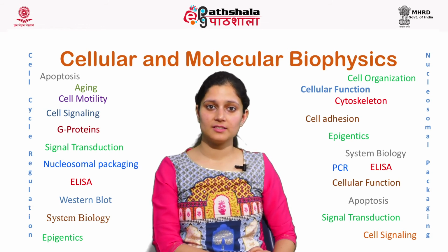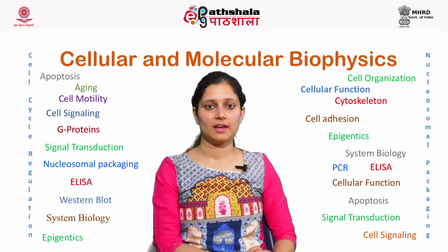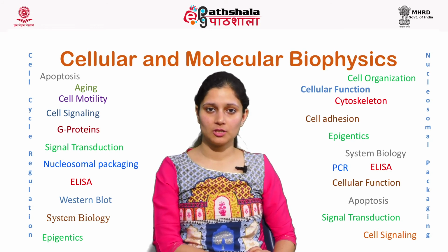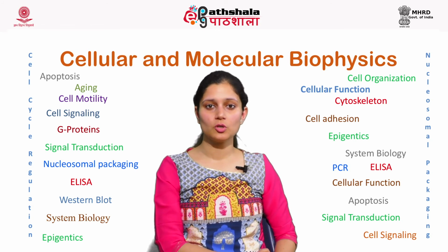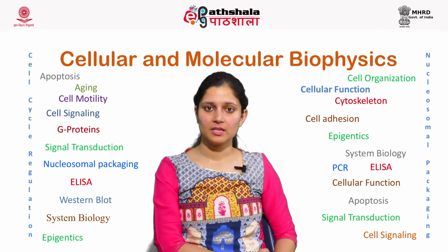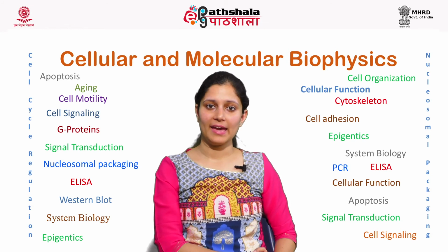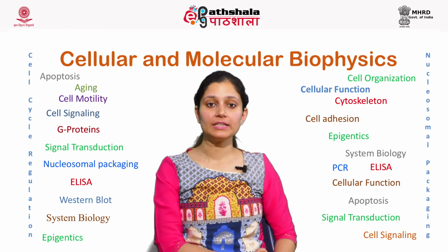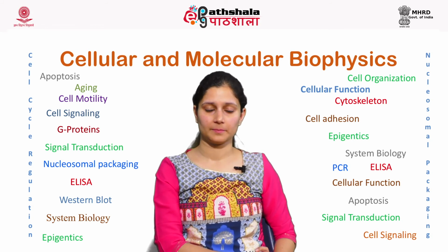When the double-stranded DNA dye binds to double-stranded DNA, it emits a fluorescence which can be captured by the real-time PCR machine. We can also use oligonucleotide probes which can hybridize to the target DNA and give a fluorescence signal which can be detected after each cycle of the PCR.